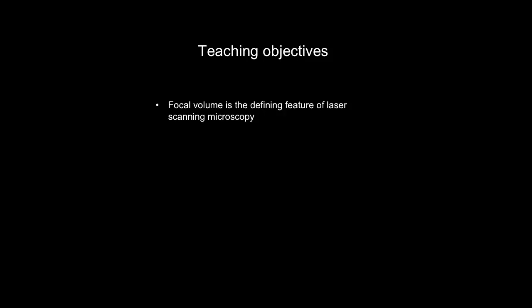We'll learn about this technique that's called laser scanning microscopy, and we'll learn that the focal volume is the defining feature of this technique. How many of you are familiar with this technique? I'm curious, so I'll know. Have you worked with it? Okay. Linear or non-linear? Confocal? Okay, well, we'll see.